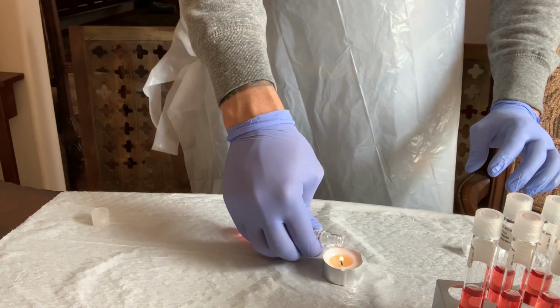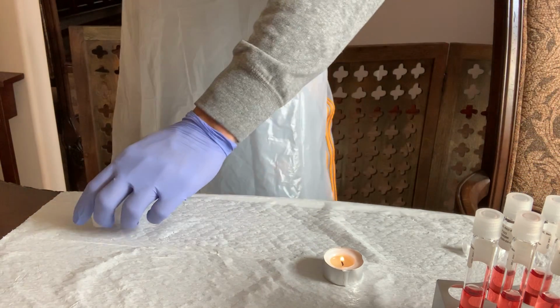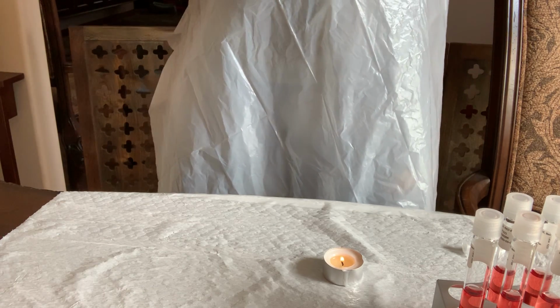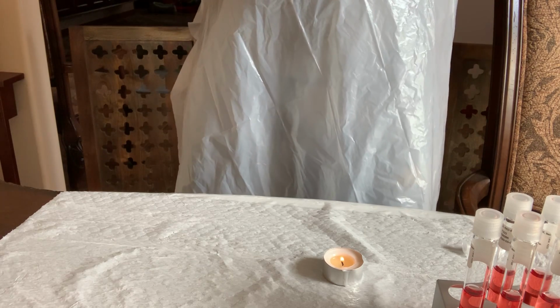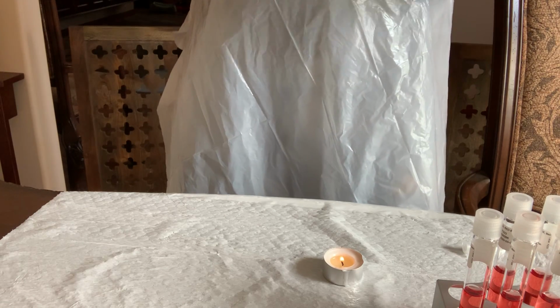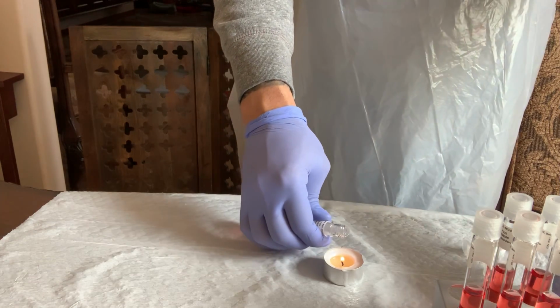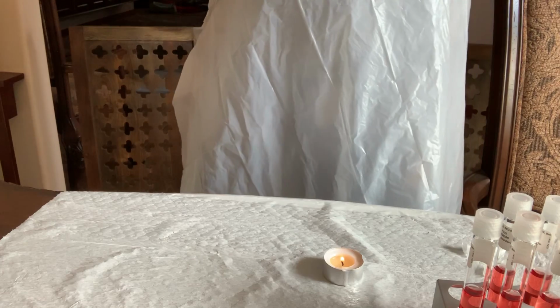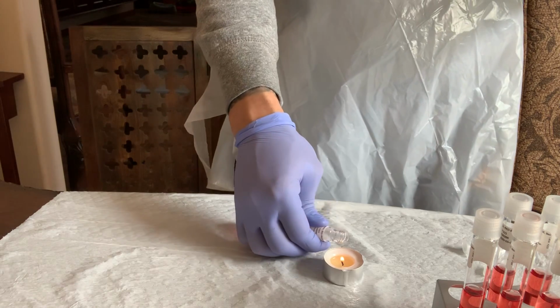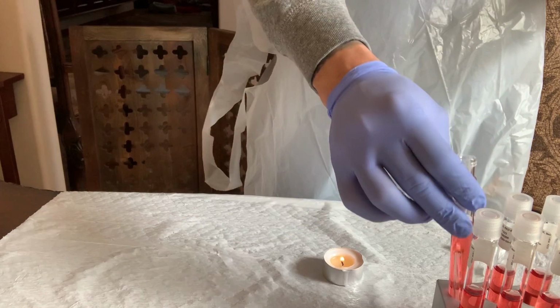We'll inoculate this again, and we'll close this. Shake it up a little bit. Make sure it's all there. We will take it off. Inoculate one more time. We'll pop our Durham tube in there. Inoculate one more time. We'll hold that there.